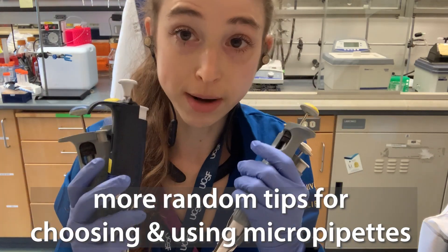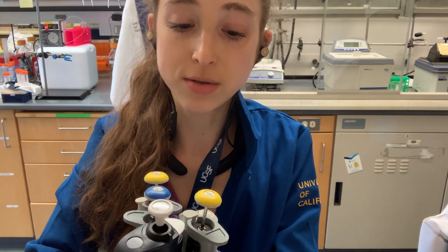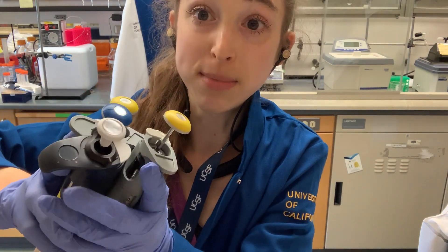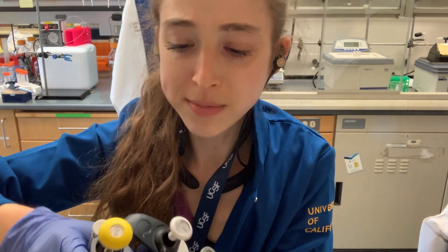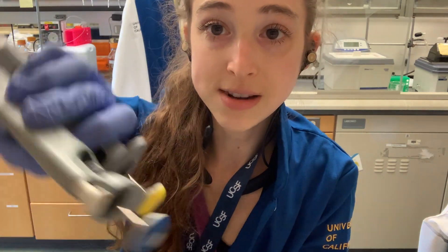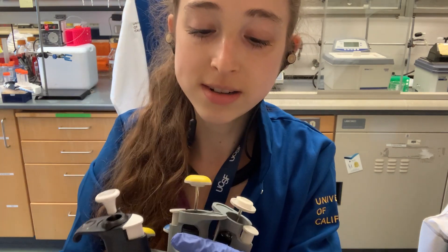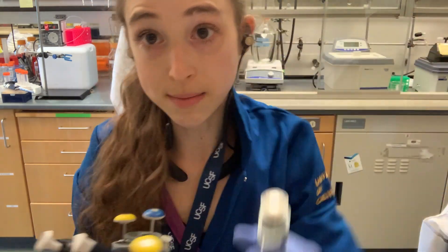Here are just a few more random tips about using micropipettes, starting with which one to choose. They come in all these different sizes and we typically refer to them by the biggest volume they have, putting a P in front of it. So a P200 gives you up to 200 microliters, a P1000 a mil, a P2 is 2 microliters, P20 is 20 microliters, and a P10 is 10 microliters.